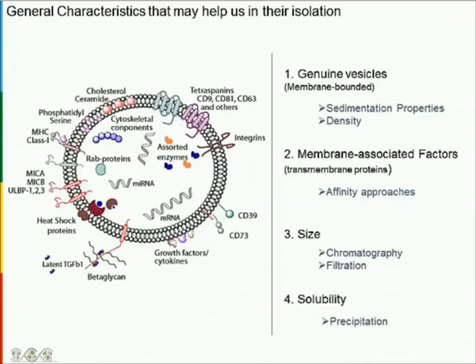And lastly, maybe we can interfere with the solution in some way and mess about with the solubility of these things and hope they drop out of solution. So I'm going to cover these 4 points in the remainder of my talk.